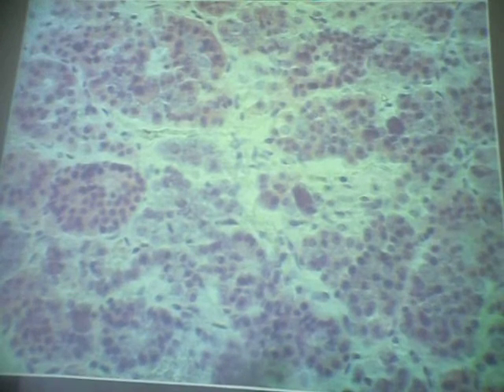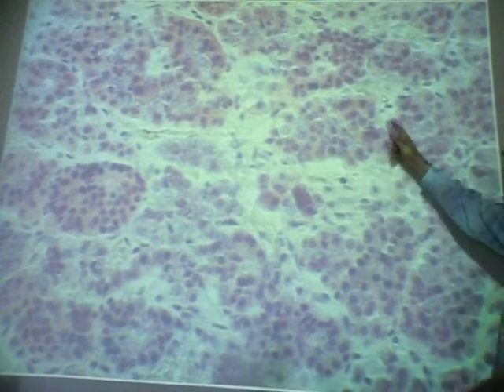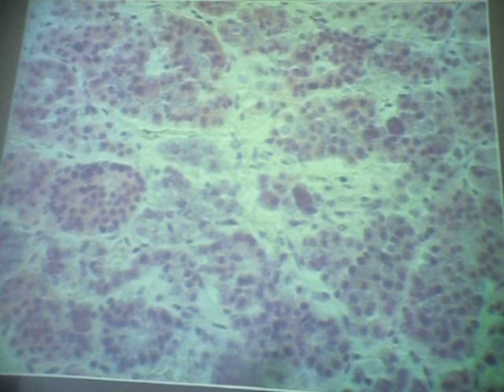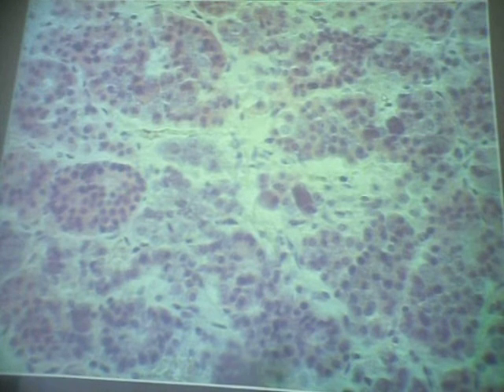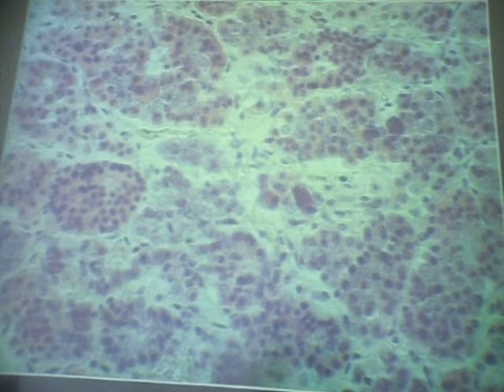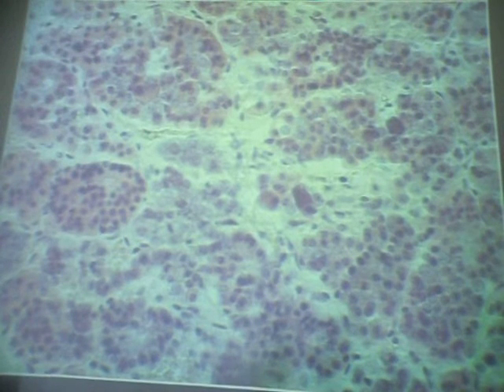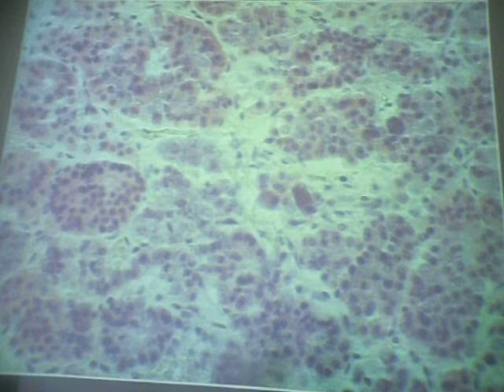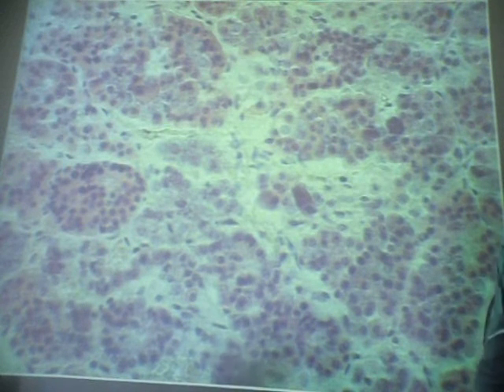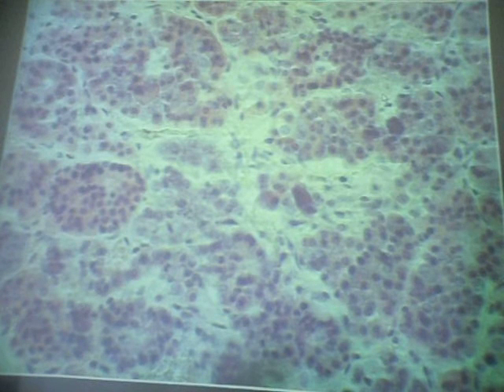Okay, the basophil cells you see here, with the dark purple cytoplasm, not the nucleus, but the cytoplasm. These produce a wealth of hormones, and for the most part, they're hormones that stimulate the production of hormones by other endocrine glands. So they're called stimulating hormones. For example, thyroid stimulating hormone, TSH for short. As the name suggests, this stimulates production of the thyroid hormones by the thyroid gland.